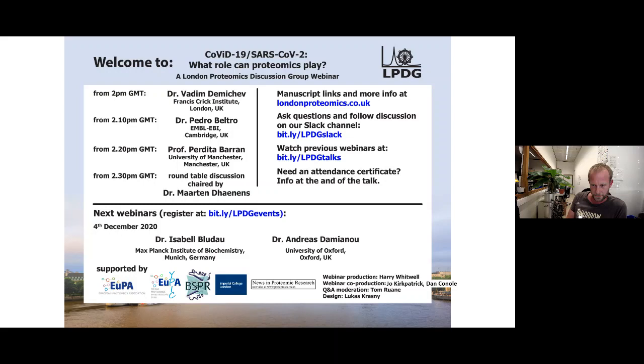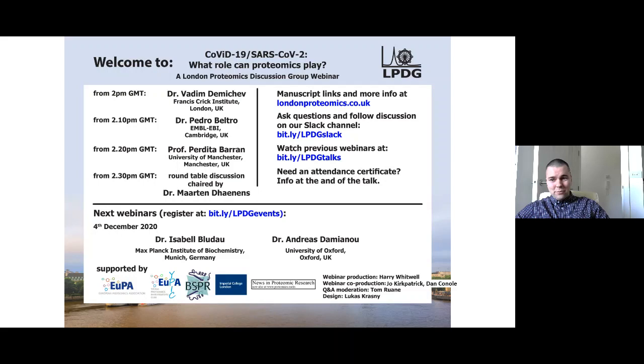So I'm not aware personally of anything based on things like that, but ultimately, of course, the purpose is to find biomarkers which are able to tell, okay, this patient is low risk, this patient is high risk, and adjust treatment decisions based on that. And that's what we hope will eventually be how it works. And we try to basically characterize every single protein we detect, every single clinical lab measurement in terms of how characteristic it is of severity and how predictive it is. So two things. It's just striking that some of them are very characteristic, but are not predictive at all. One example is the protein gelsolin. It goes down in severe coronavirus. It doesn't seem to be predictive. Some things are very predictive on the other hand. And this, for example, allows us to tell, okay, these are routine clinical markers, they're measured already. You don't need to establish any separate assays for them. You just know which of them to look at, which are really predictive, which are just characterizing what has been happening with the patient in the past.